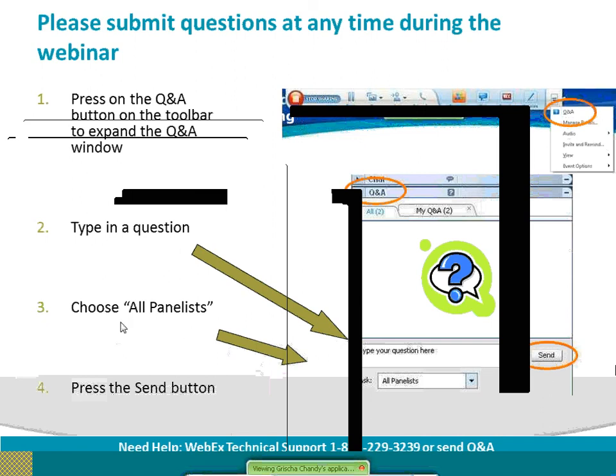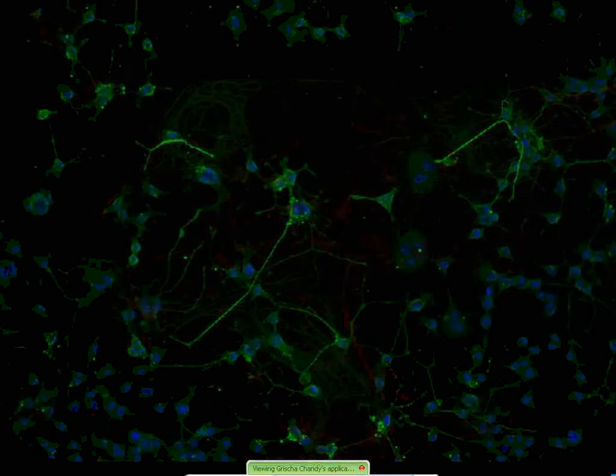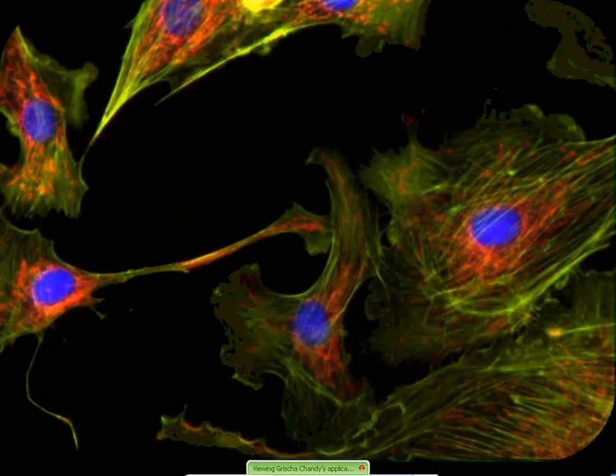Great. So that's a great question, and I should have made a mention to that point in the presentation. The hepatocytes that we're currently manufacturing at commercial scale for customers are derived from a single iPS cell line, and it's the same iPS cell line that we use for our other commercial products for the cardiomyocytes and neurons that we manufacture. However, we have made hepatocytes from iPS cells from a number of different donors, and we are able to differentiate highly pure hepatocytes across multiple donors.